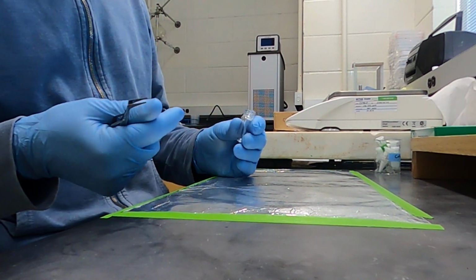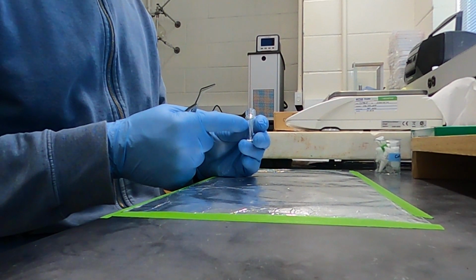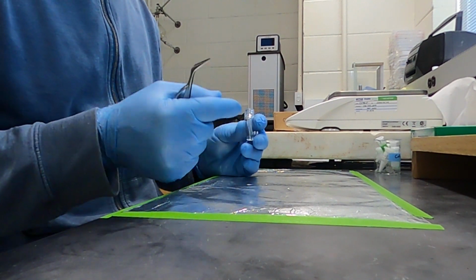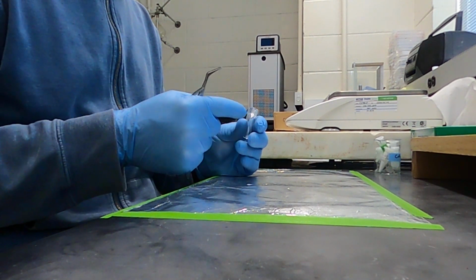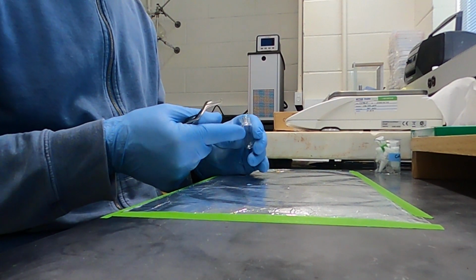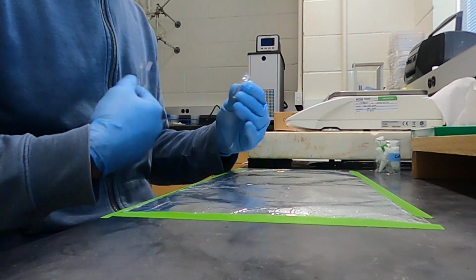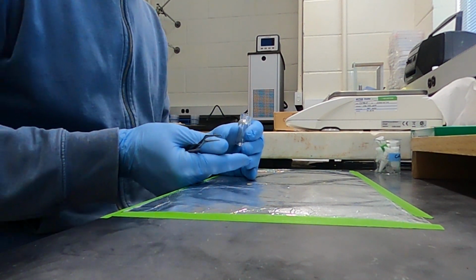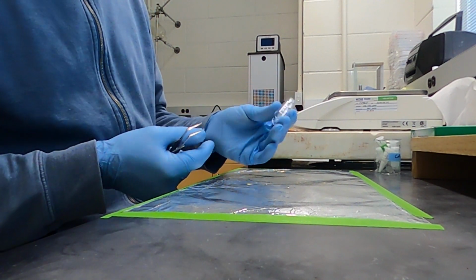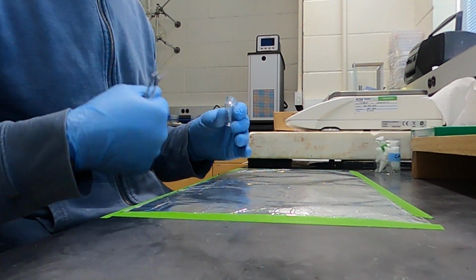And the only reason why we use tiny vials is because that way the samples, the CO2, because it's CO2 we measure, after dissolution of the carbonate shells, the CO2 won't be diluted as much because the volume of the vial is less. The CO2 won't be diluted as much, so we'll have a higher signal. So that's why we use small vials. I prefer to use larger vials. It's more forgiving, but in that case, that's the way we have to do it. It works, but it's easier and a little bit better, at least in my opinion, to use larger vials.